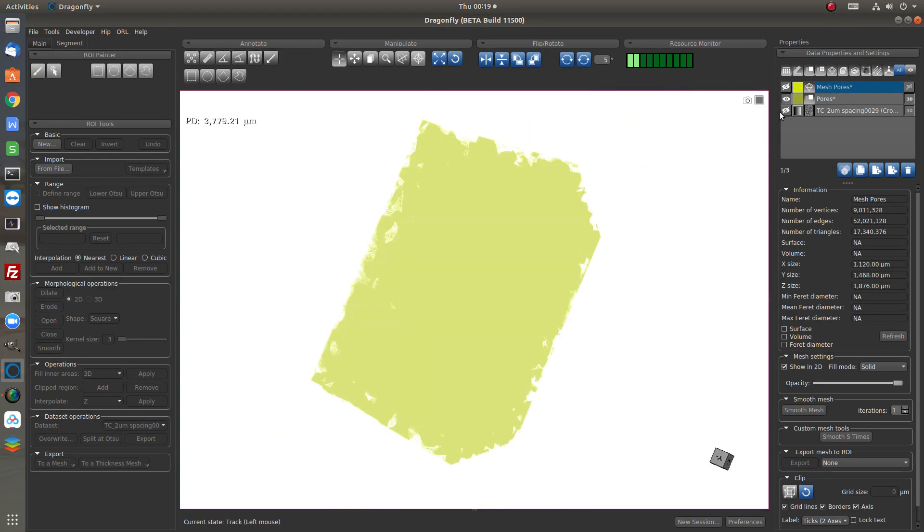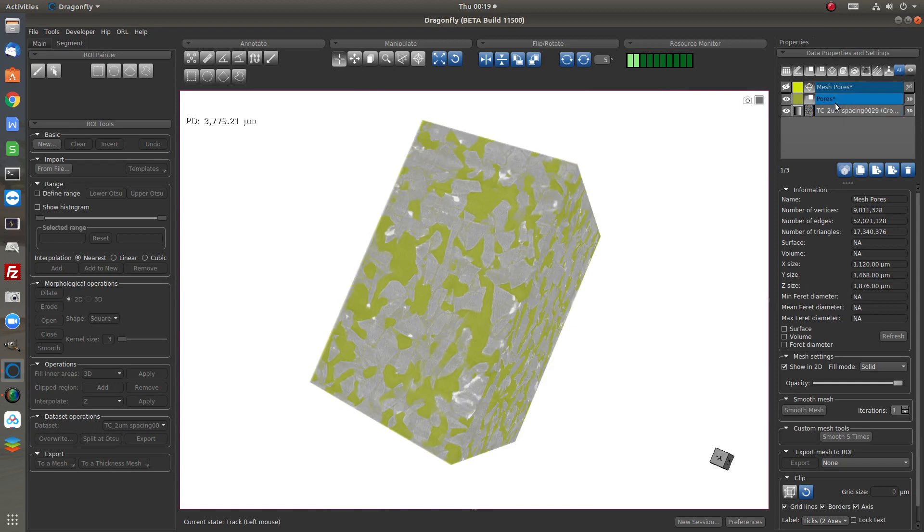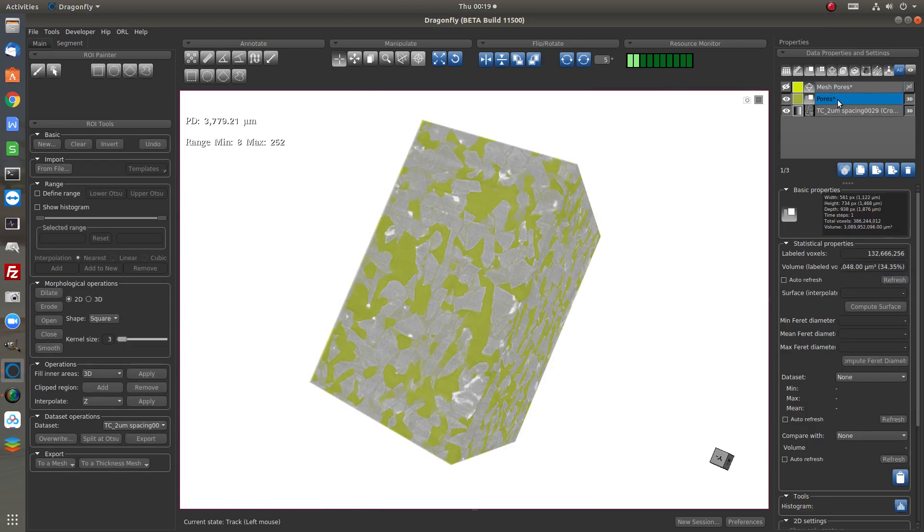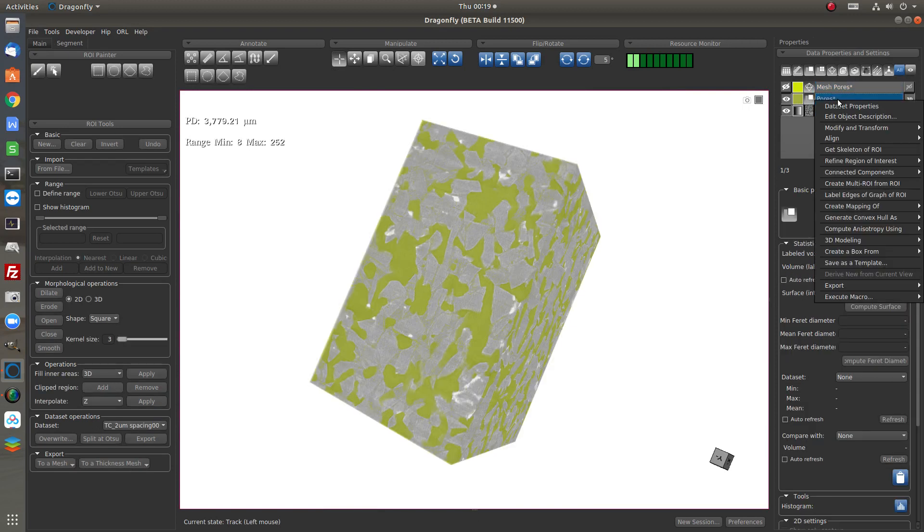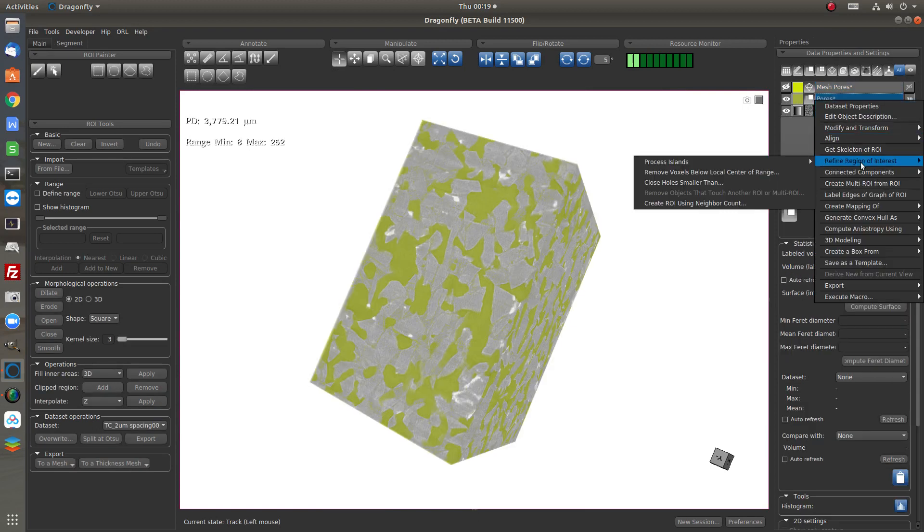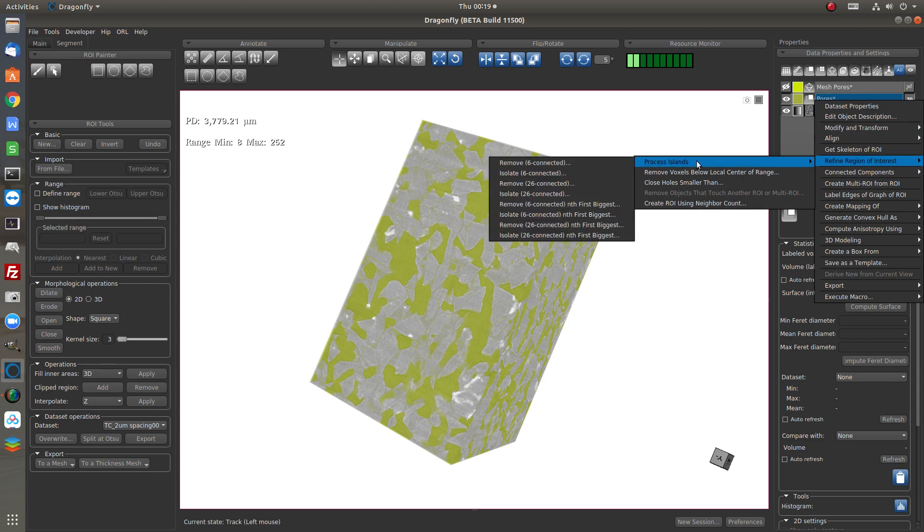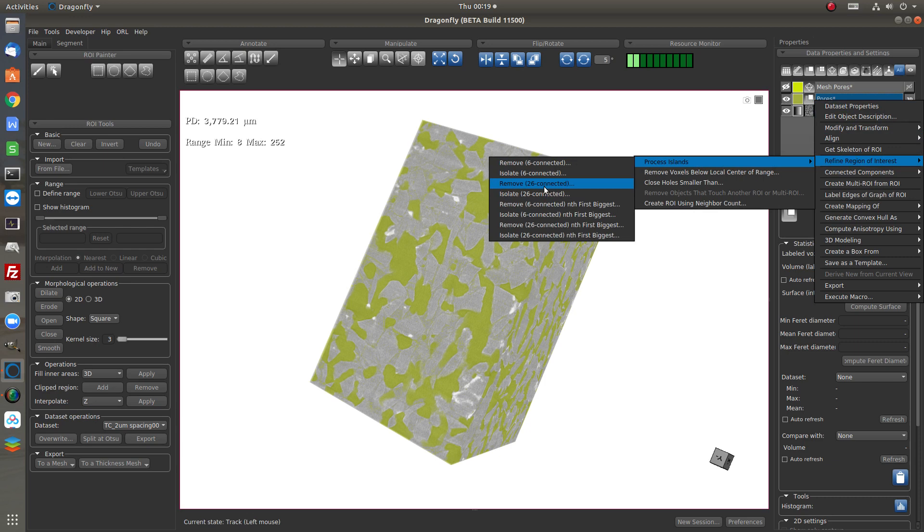We can do it here with the ROI. Refine region of interest. Process island. We can remove either 6 connected or 26 connected.